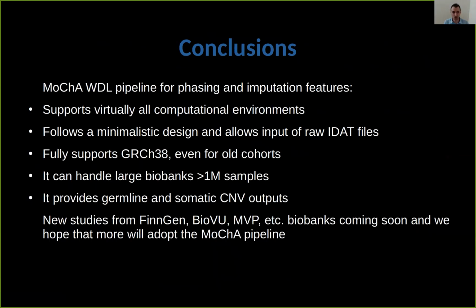And to conclude, the MoChA WDL pipeline supports virtually all computational environments. It follows a minimalistic design, and it can input IDAT files. It can be used on GRCh38 without further hurdles, and it can scale to biobanks of any size. And if you're interested in CNV analysis, it actually will provide germline and somatic outputs for further study.